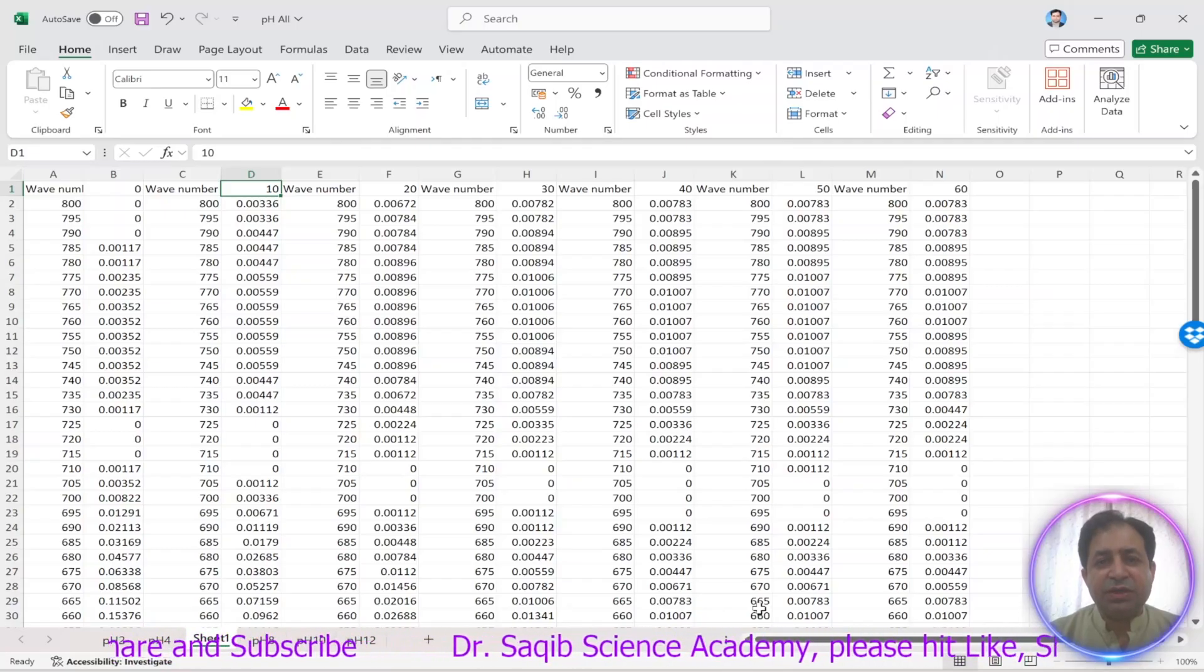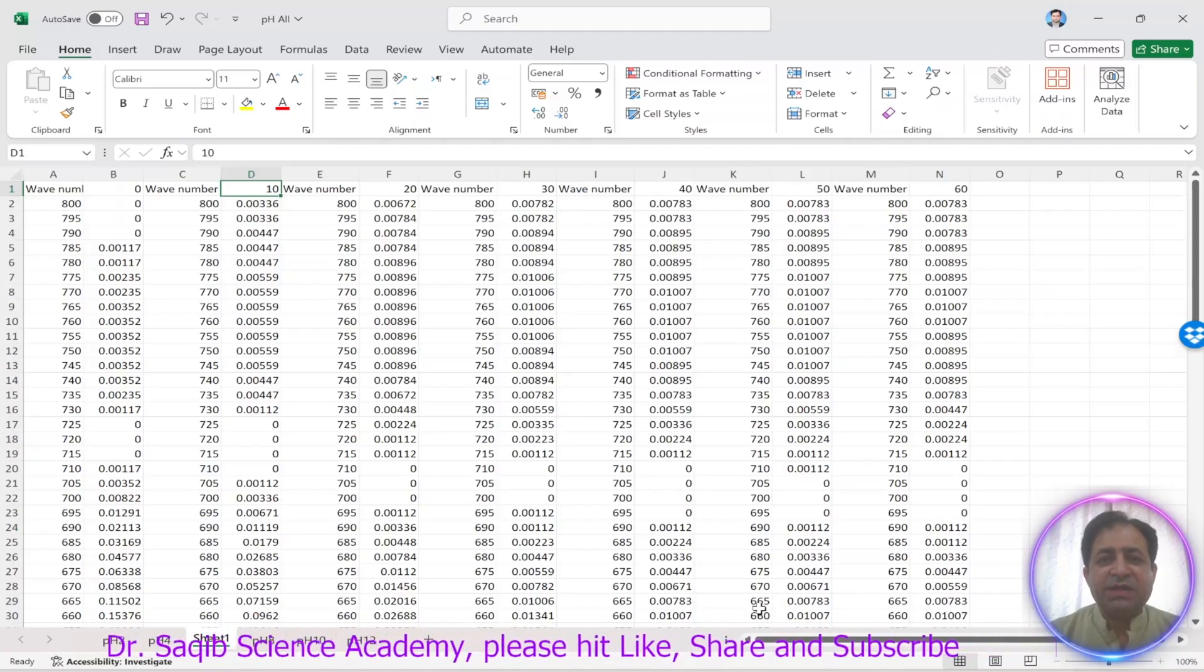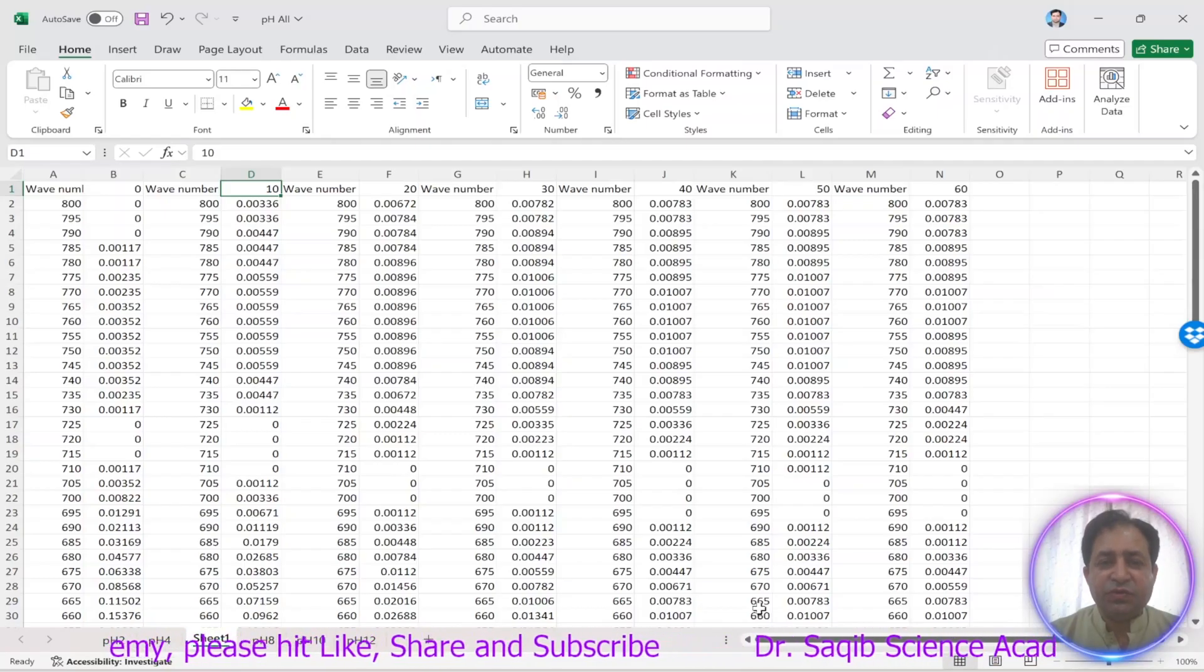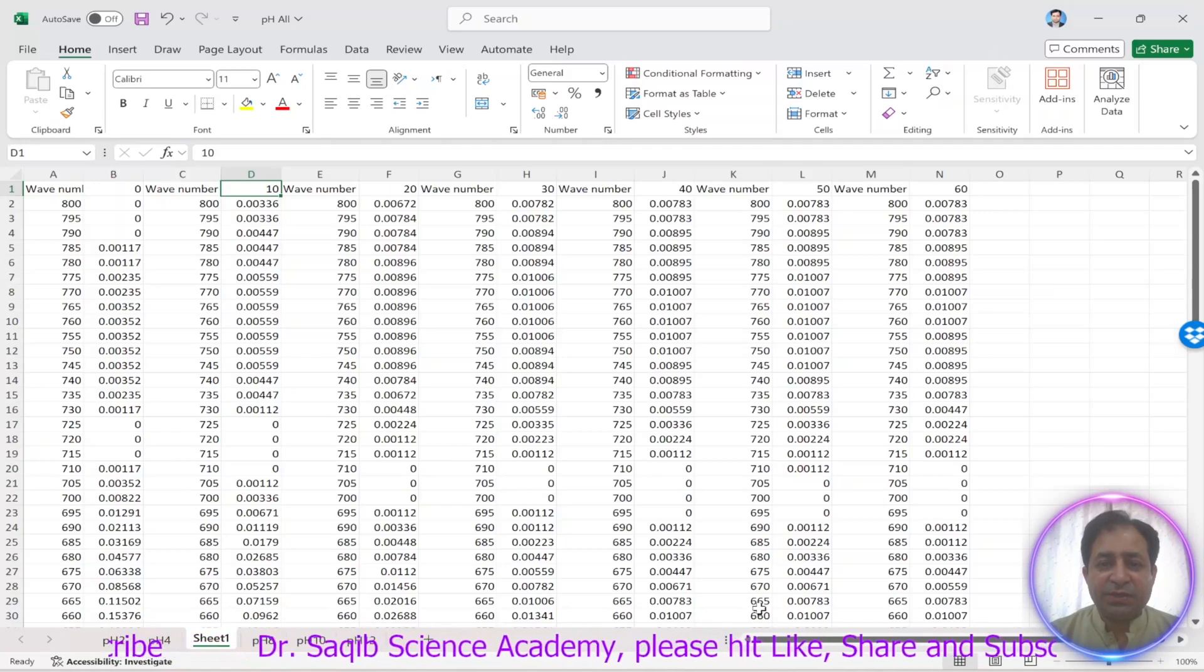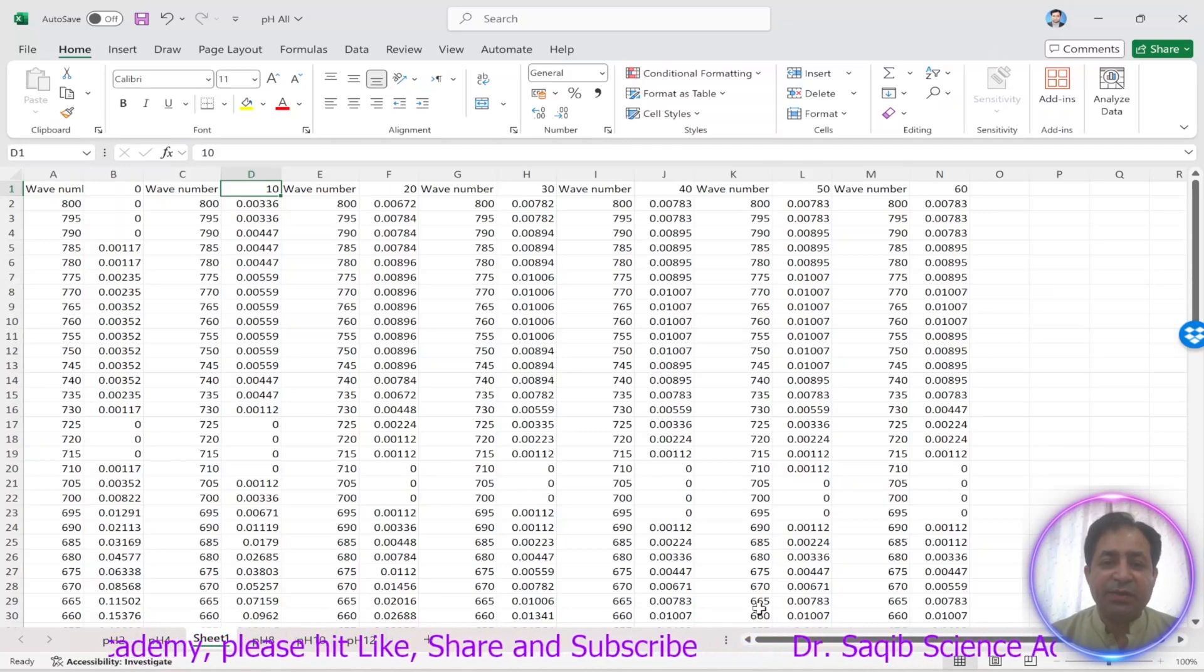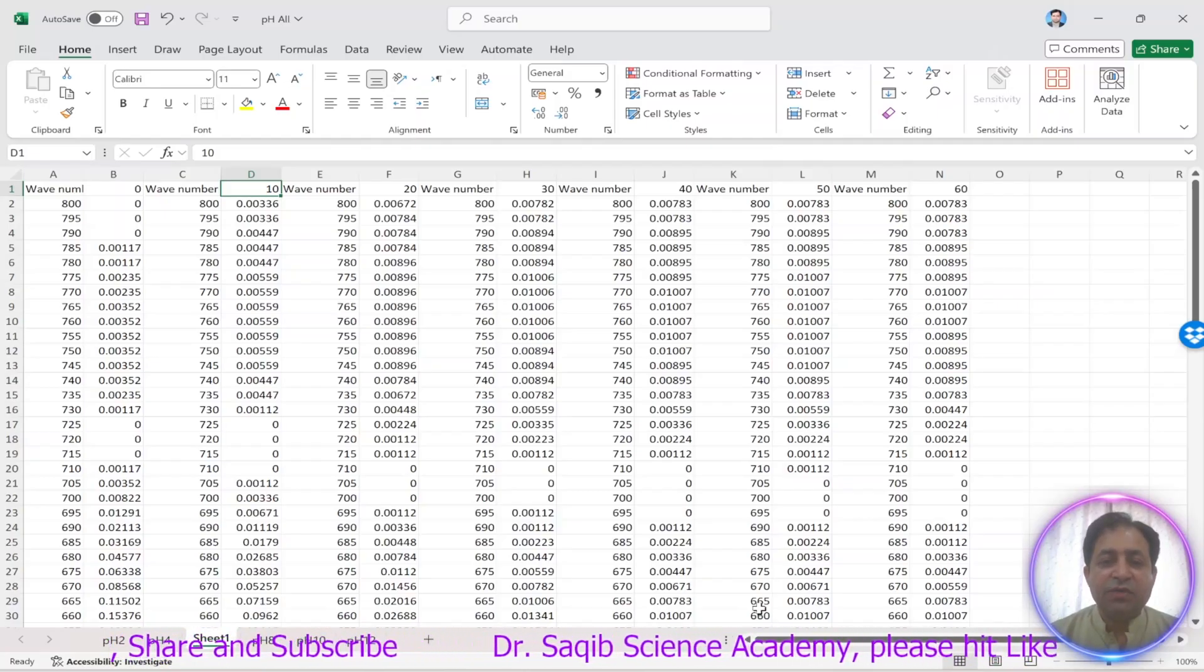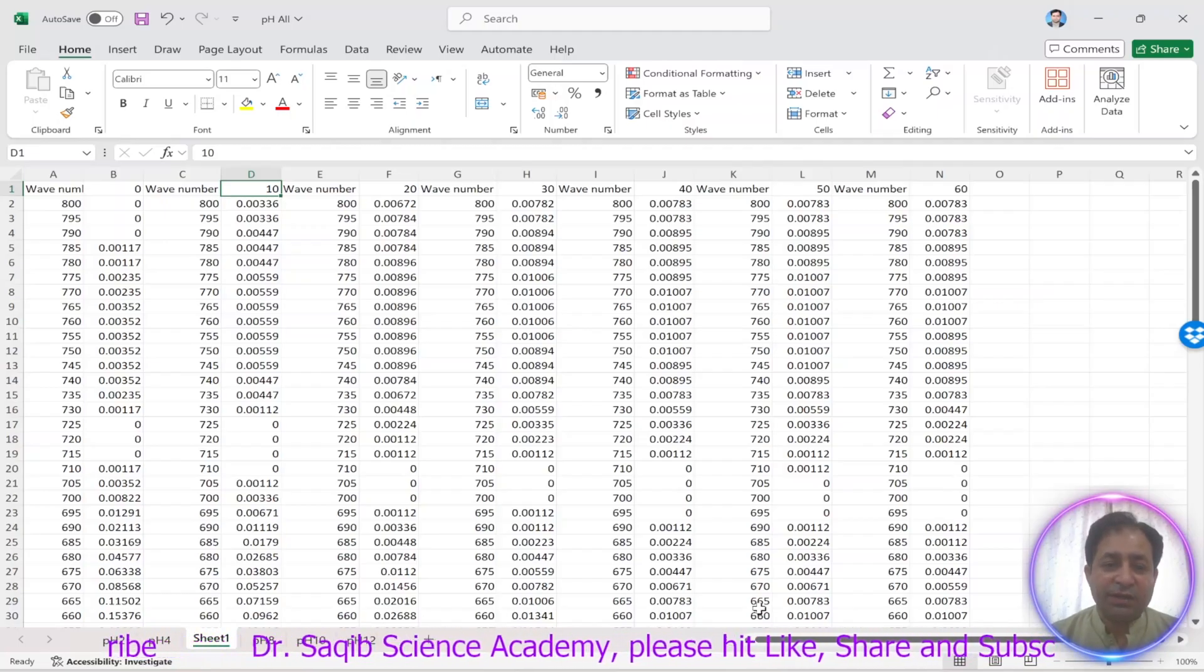Today in this tutorial we will discuss how to plot UV visible data using Origin. This data we obtained during our dye degradation study. The dye which we used during the degradation was reactive black 5 dye. We did the adsorption experiment for almost 60 minutes and after every 10 minutes we put our sample interval. You may have different time intervals, so for every time interval you have to take that.